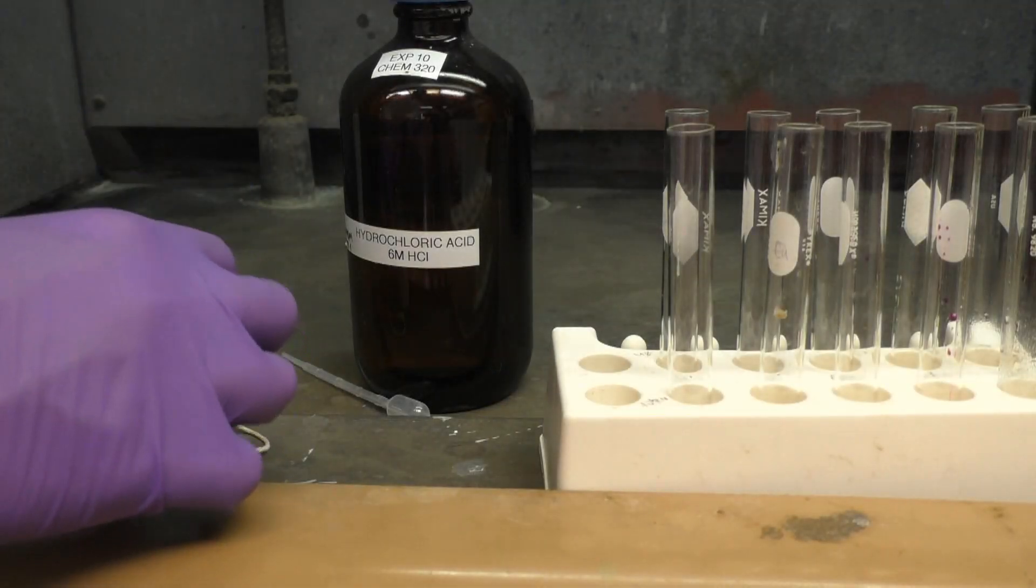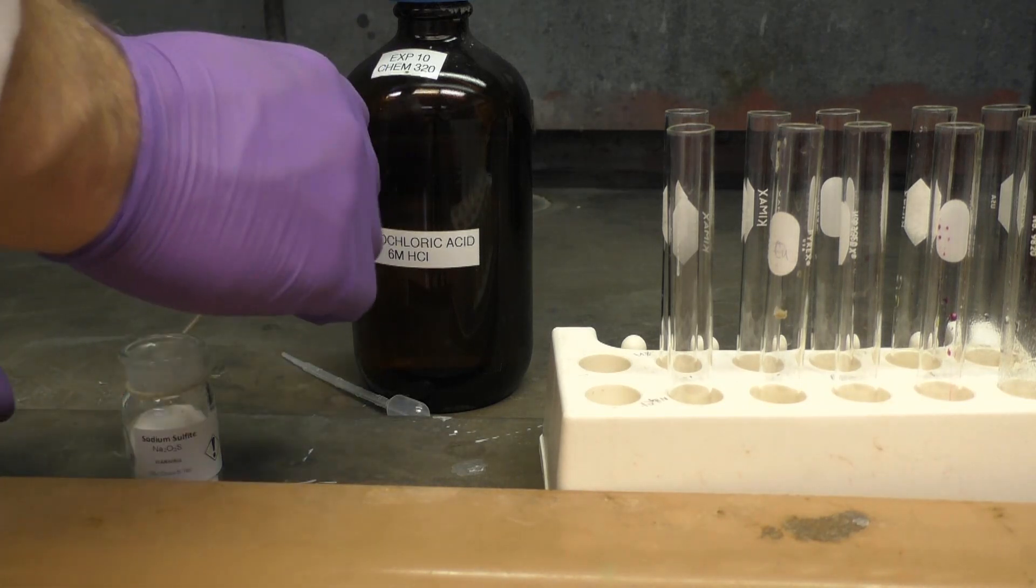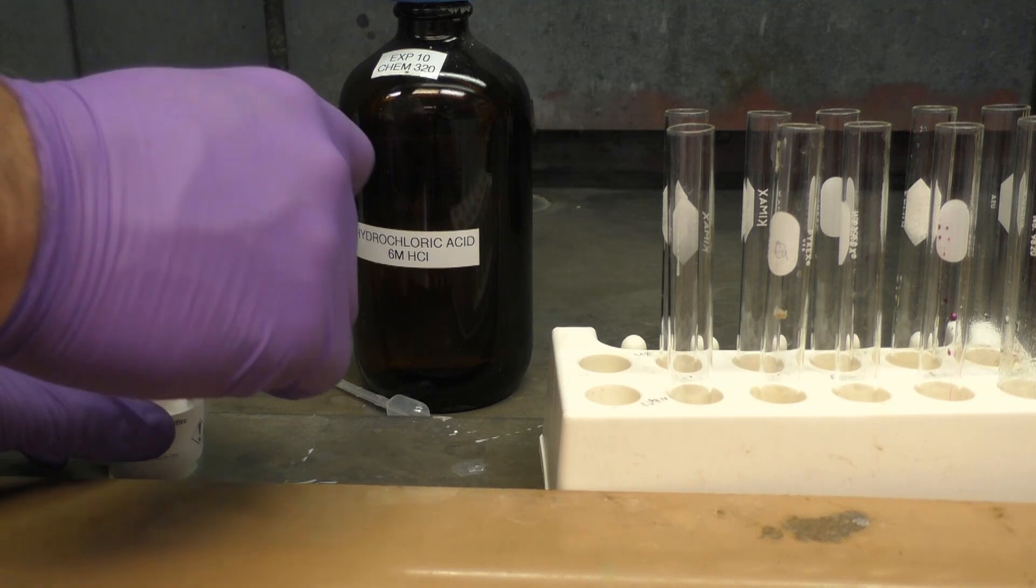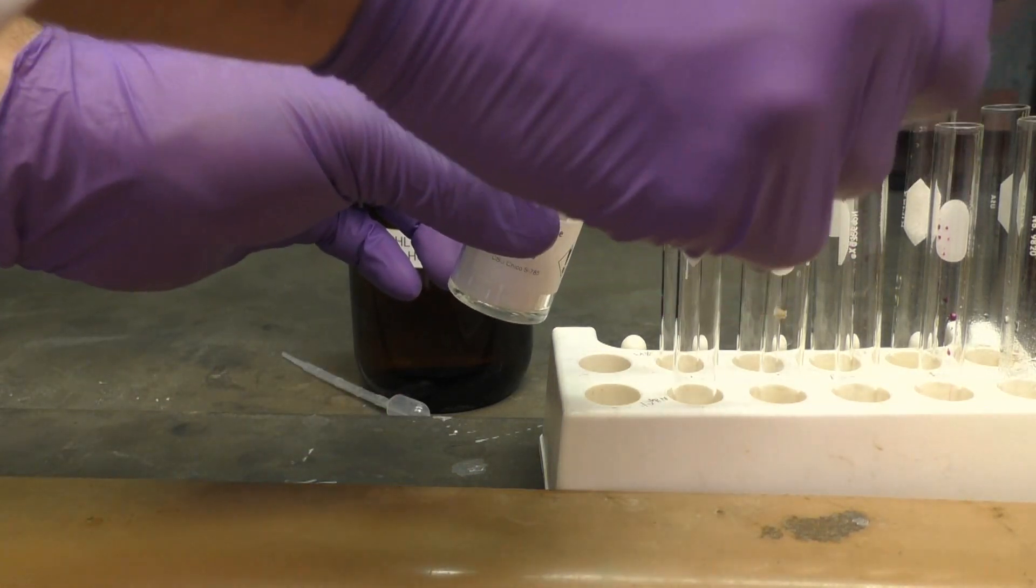For our last reaction, we'll do a metathesis reaction that forms a gas. Here we're in the hood and adding a small sample of solid sodium sulfite. And then we're adding a few drops of 6 molar HCl.